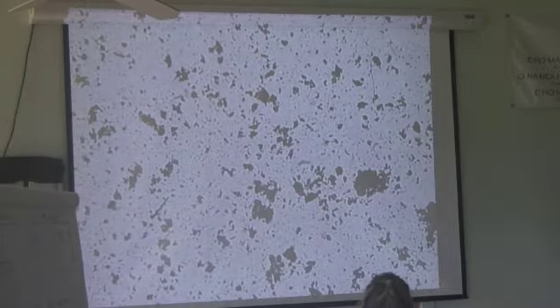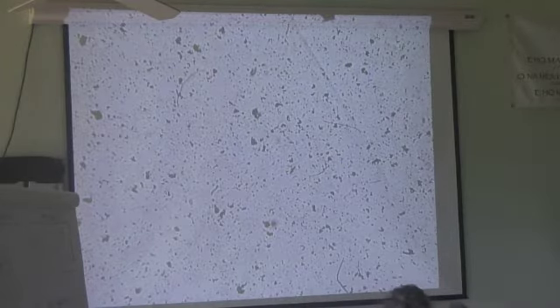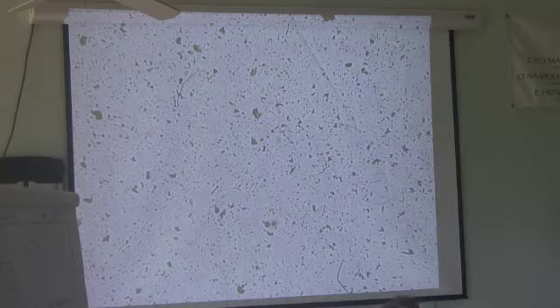You have to go up in higher mag to determine whether the strands that you're seeing here are actino or whether they are really fungi. And you probably want to go up in mag when you see some of the little zoomers in there and make sure, is that a flagellant or is that a ciliate? These are a little hard to tell because there's a little bit of sideways bubble in there, so I want to go up in there. I'm looking for nematodes right now. The first sample of this that we have, there were like 3 nematodes in it.